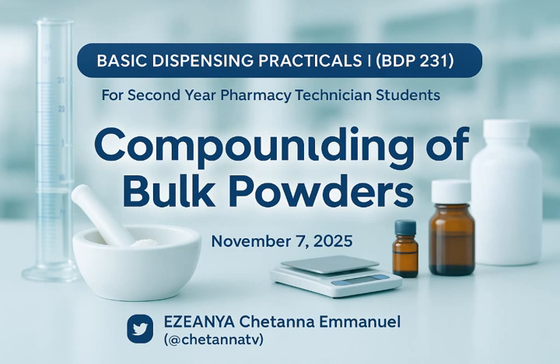But for the purpose of this particular practical, the categories we are looking at are bulk powders and divided powders. Bulk powders are packaged in one big container, just like your dusting powder. You know your dusting powder, right? It's a type of bulk powder. Everything is in one big container.